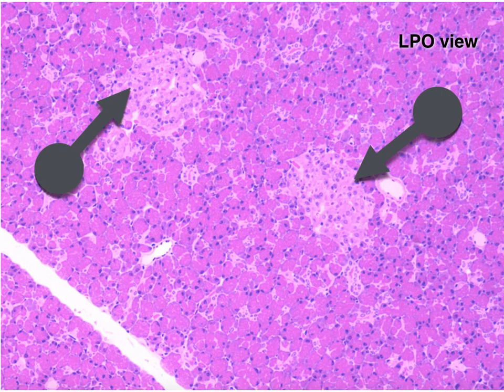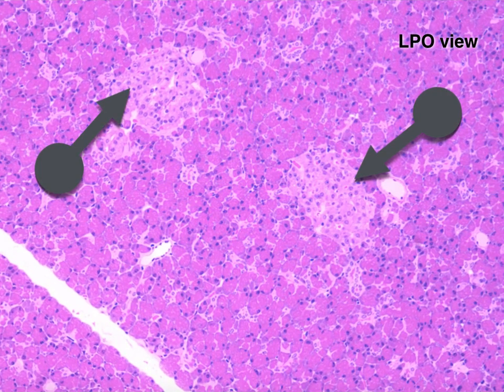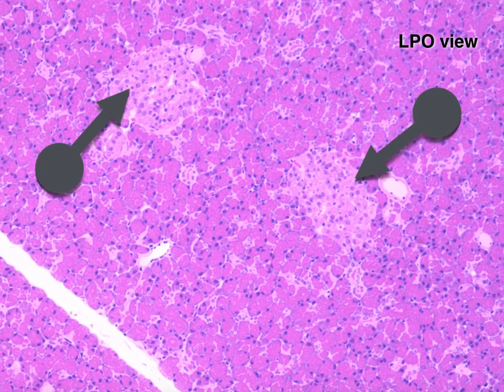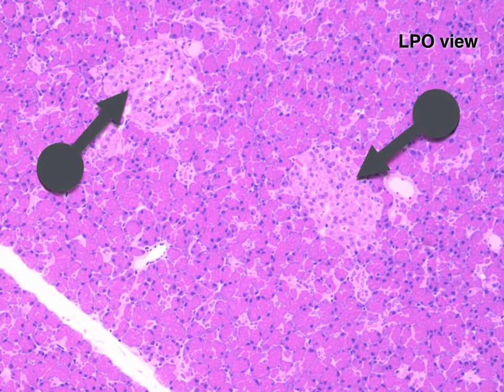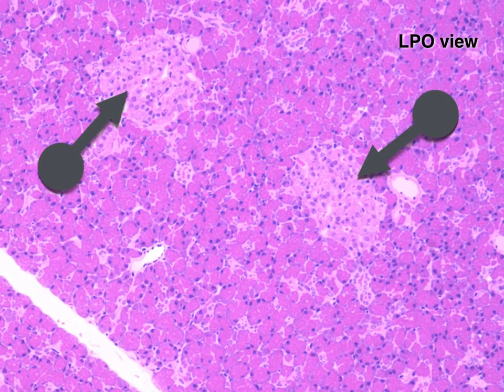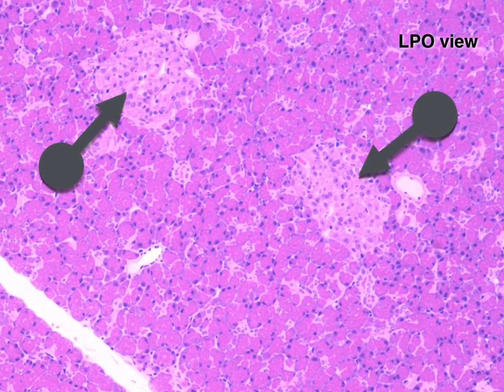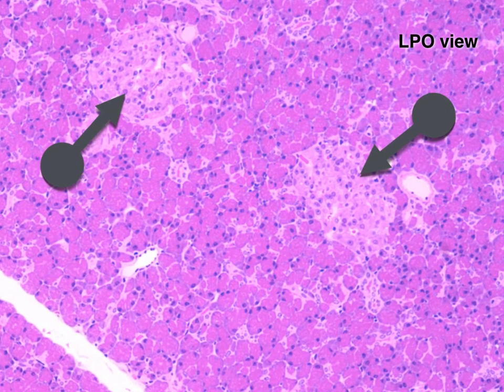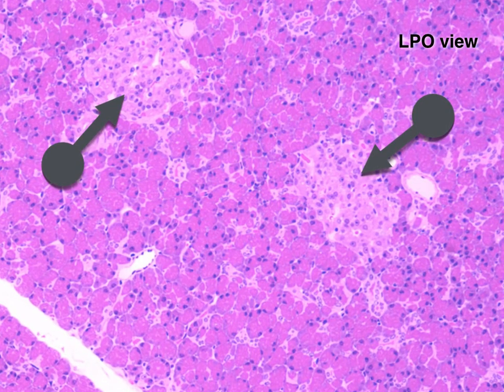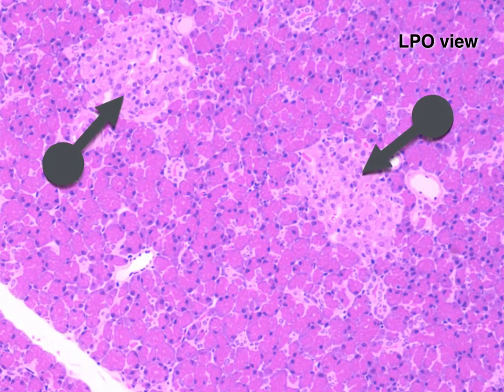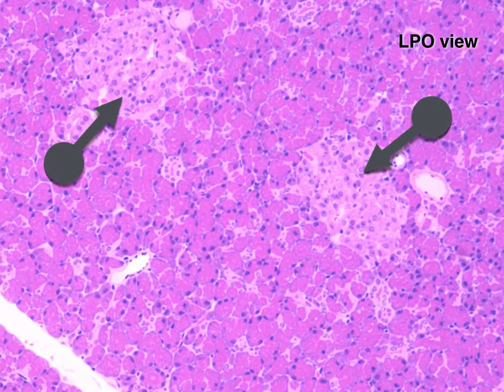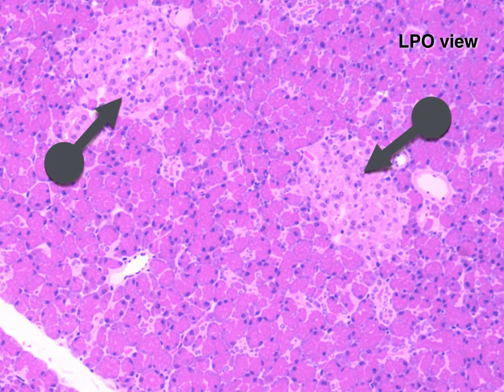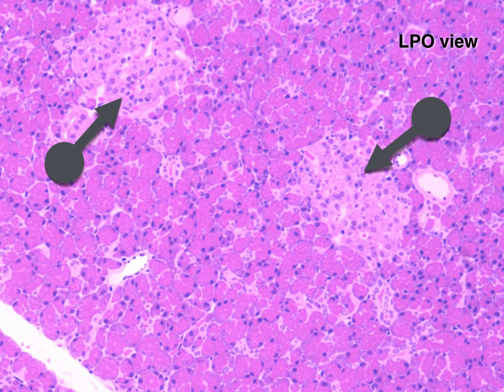The islets of Langerhans, as pointed by the two arrows, appear as distinct islands in a sea of pancreatic acinar cells. They constitute just a small percentage — two percent — of pancreatic tissue. The islets can be identified because of their distinct geometric cord pattern and high vascularity when compared to the acinar cells. Within the islet are alpha, beta, and D-cells. Several blood vessels are also visible near the islets.